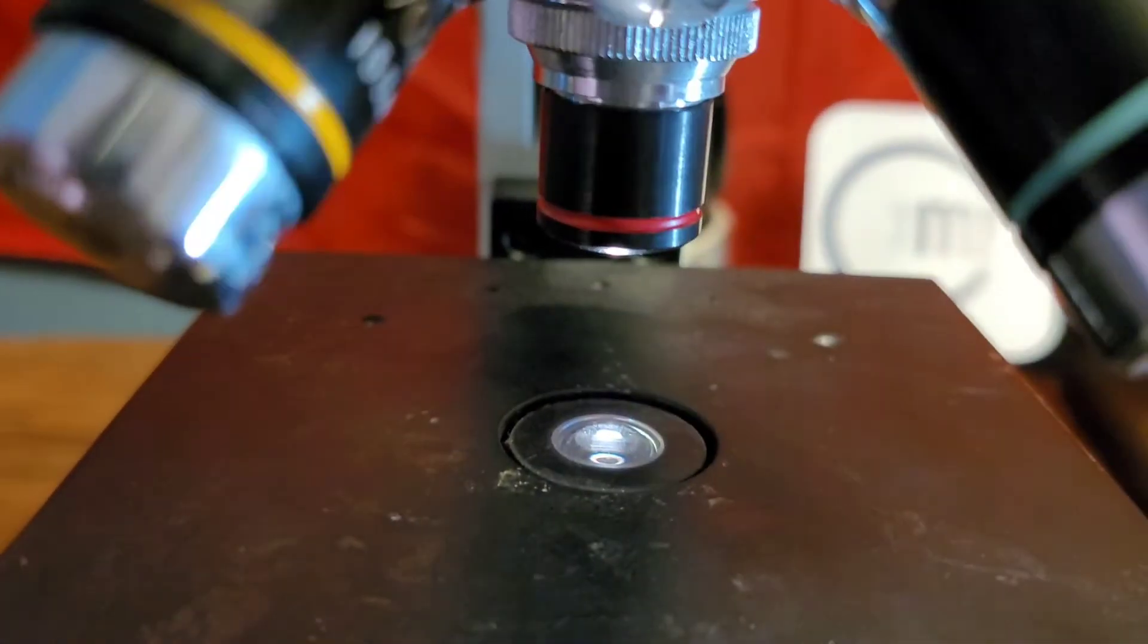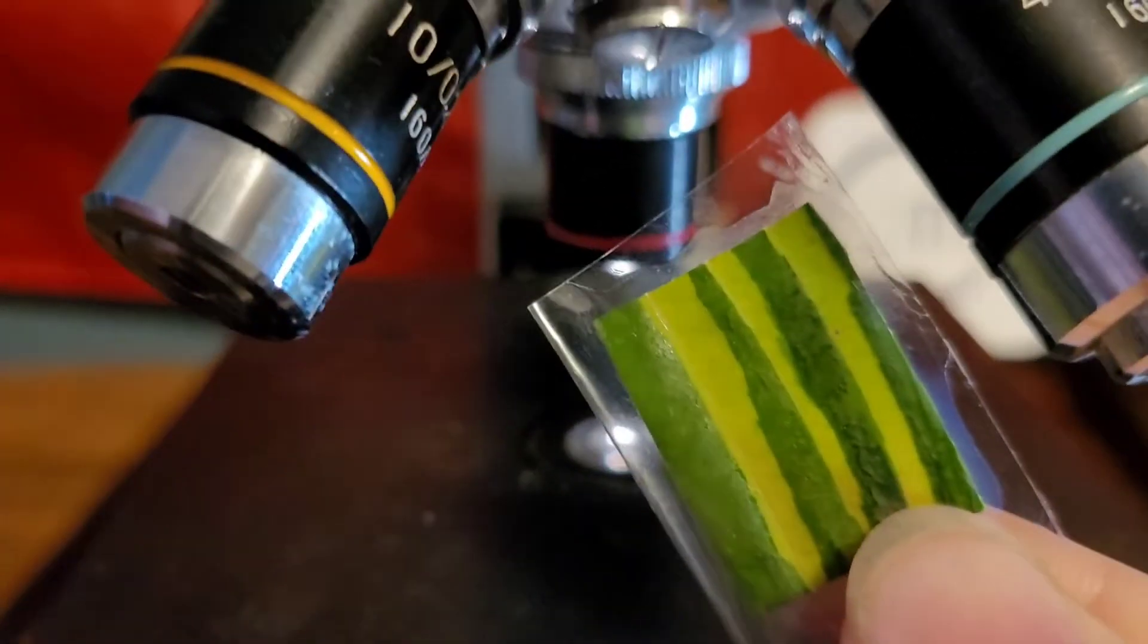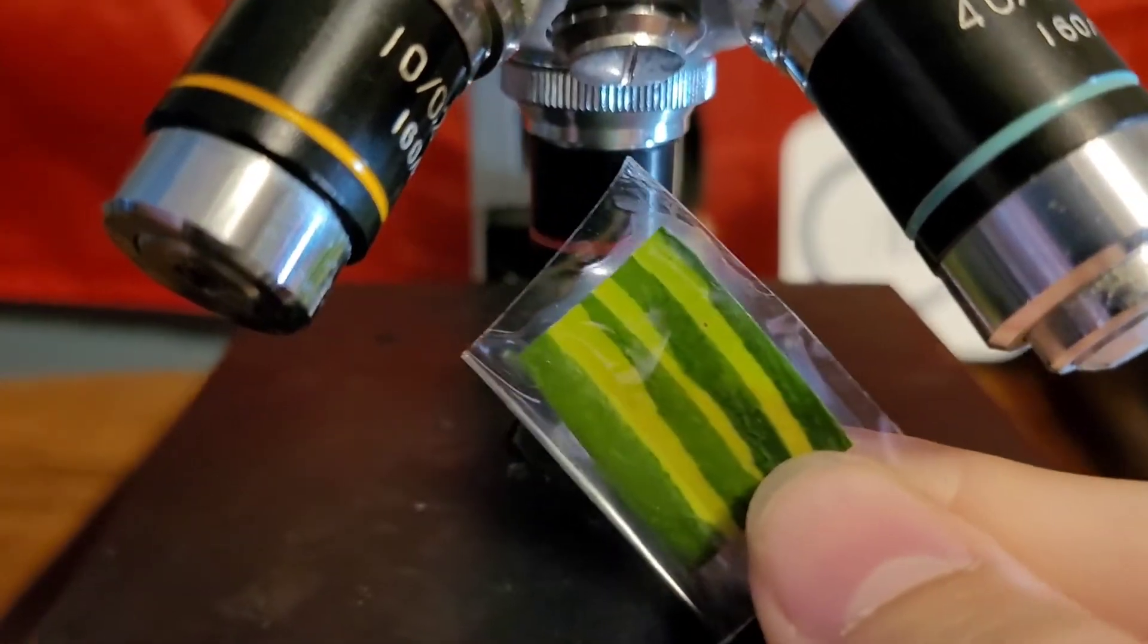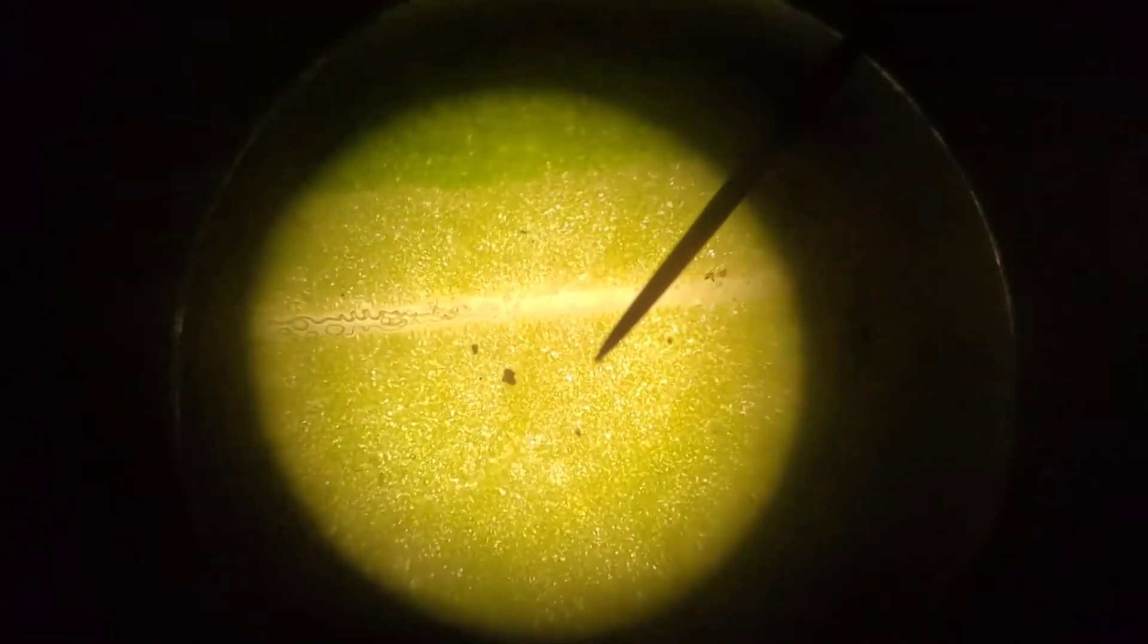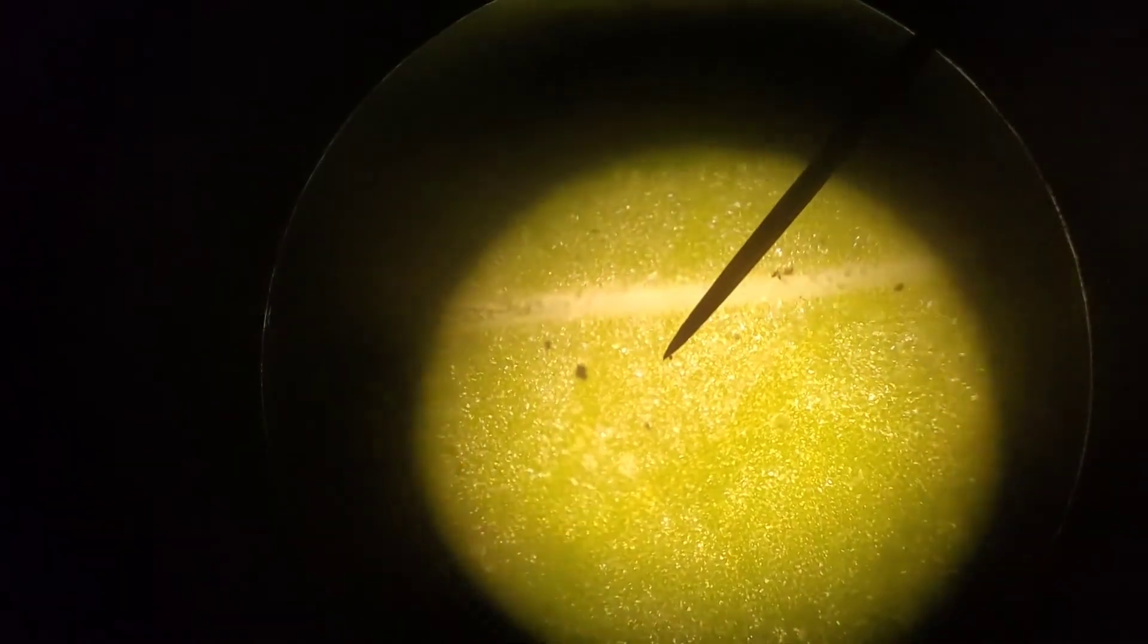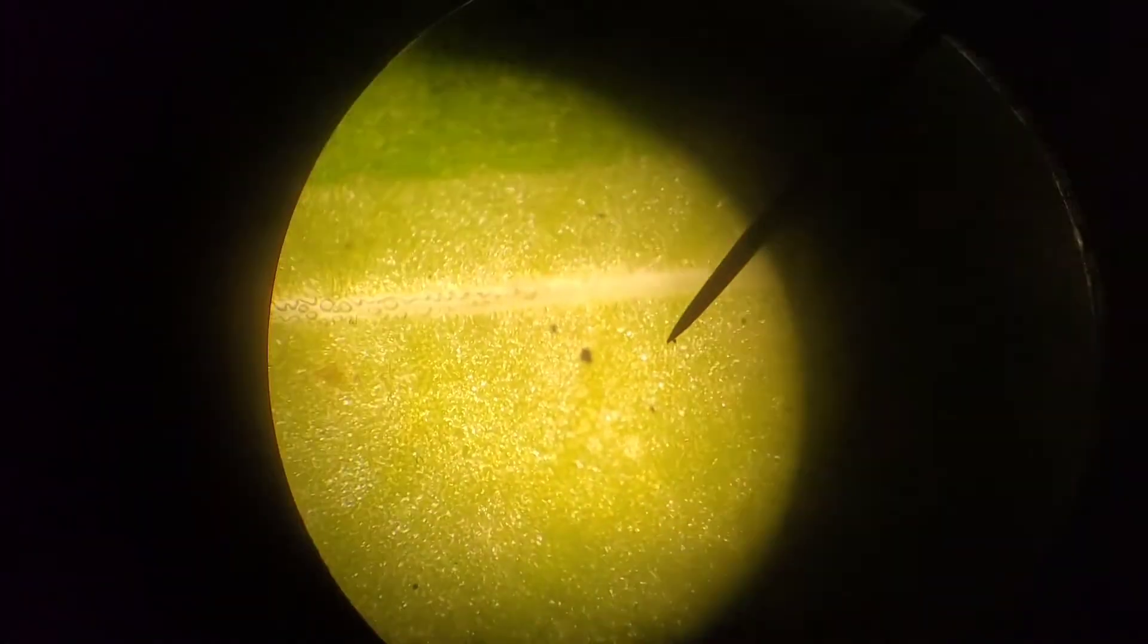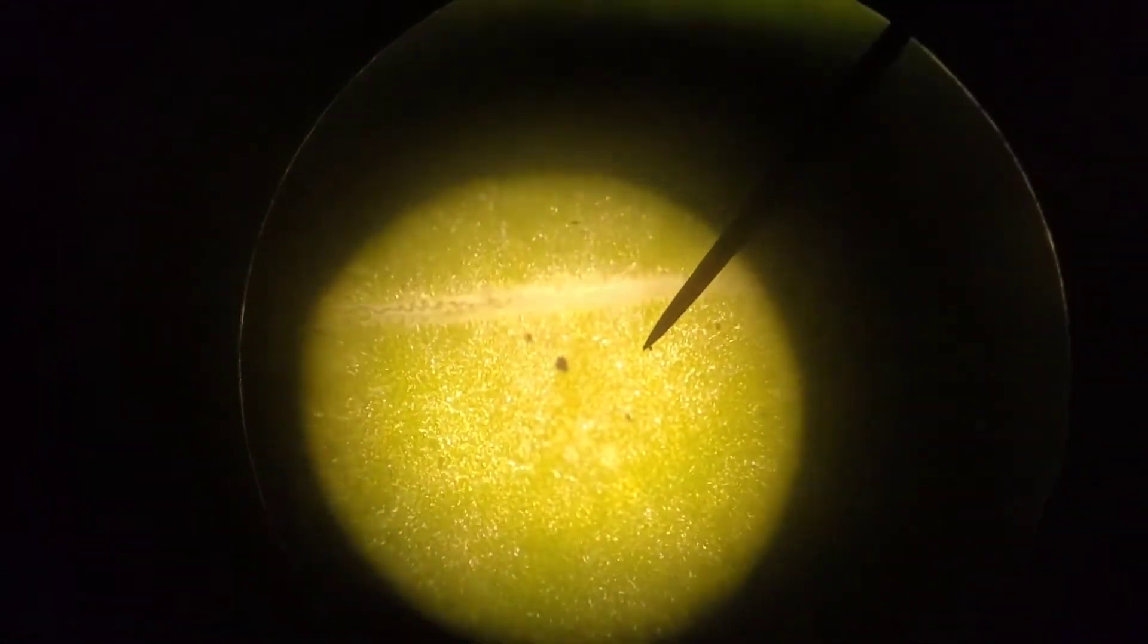This one's off of a hosta. It's kind of like two colors at once, so this one should be cool. The weird thing is, under the microscope, you can see the white parts are veined, but you can see where the green and the light green meet. And it's not as pronounced as you'd think it would be. It's a lot more subtle up close under the microscope. And then there's more debris, of course.